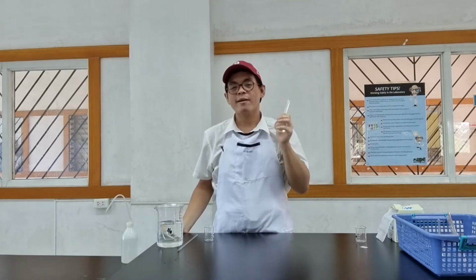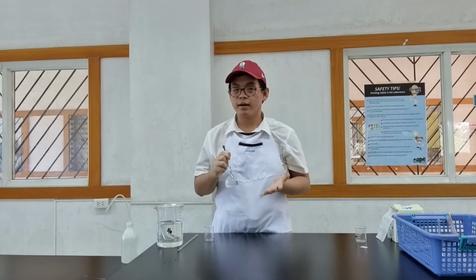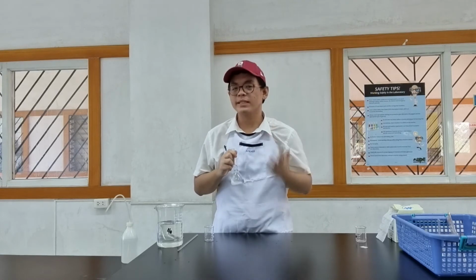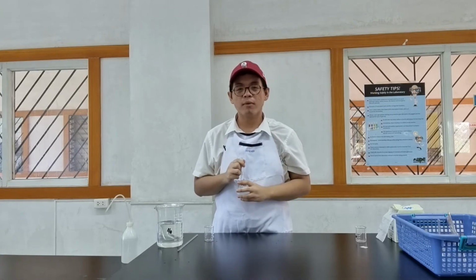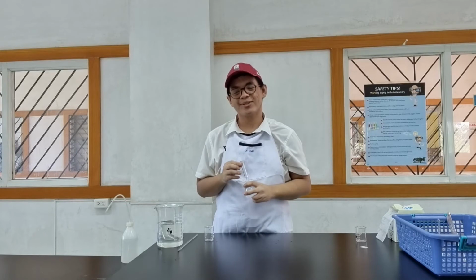I now have my 100 ml of solution. If you diluted it incorrectly, like if you passed the line, so the meniscus is above the line, that's already gone. It's not exact anymore. We want to be exact again. We want to be certain. So if you missed the mark by adding too much solvent, you need to start over. That's just how analytical chemistry works.